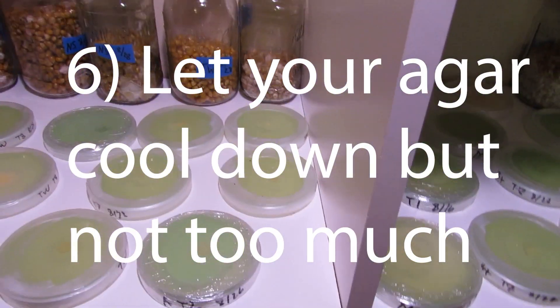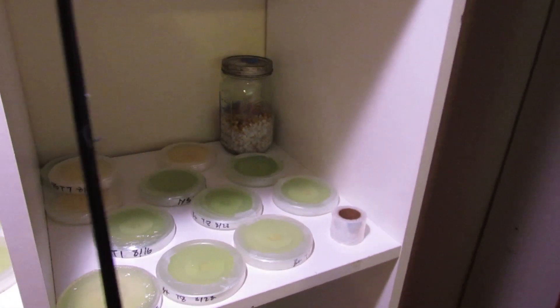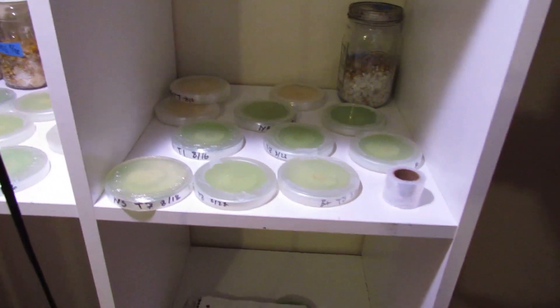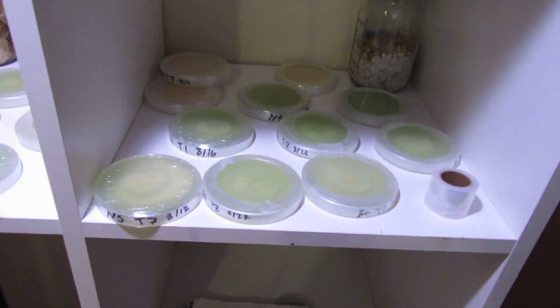Number six: let your agar cool down. Obviously if you let it cool too much it's going to pour out in little lumps, but you want to let it cool down to cut back on the amount of condensation inside your plates. It really helps and promotes good growth if there isn't a ton of moisture in there.